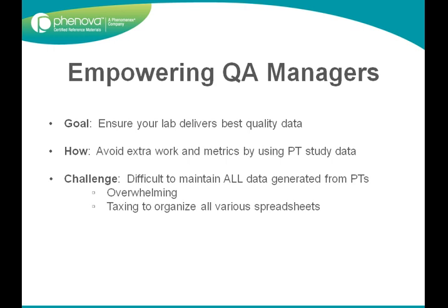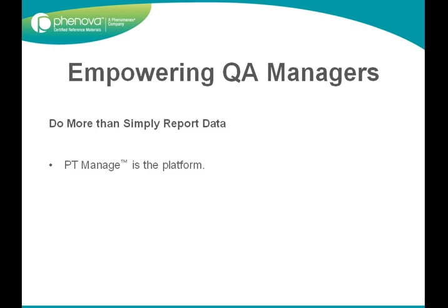So as your best partner for proficiency testing, we at Phenova have designed PT Manage using QA Manager input to simplify this process. If you've taken the time to generate and submit extensive data, then we believe you should have free access to it, so you can use it however it will serve you best. It's your data, and you know your lab's needs better than anyone. So Phenova's built the platform, PT Manage, from which you can access your data and work within it to generate whichever reports are most helpful to you.